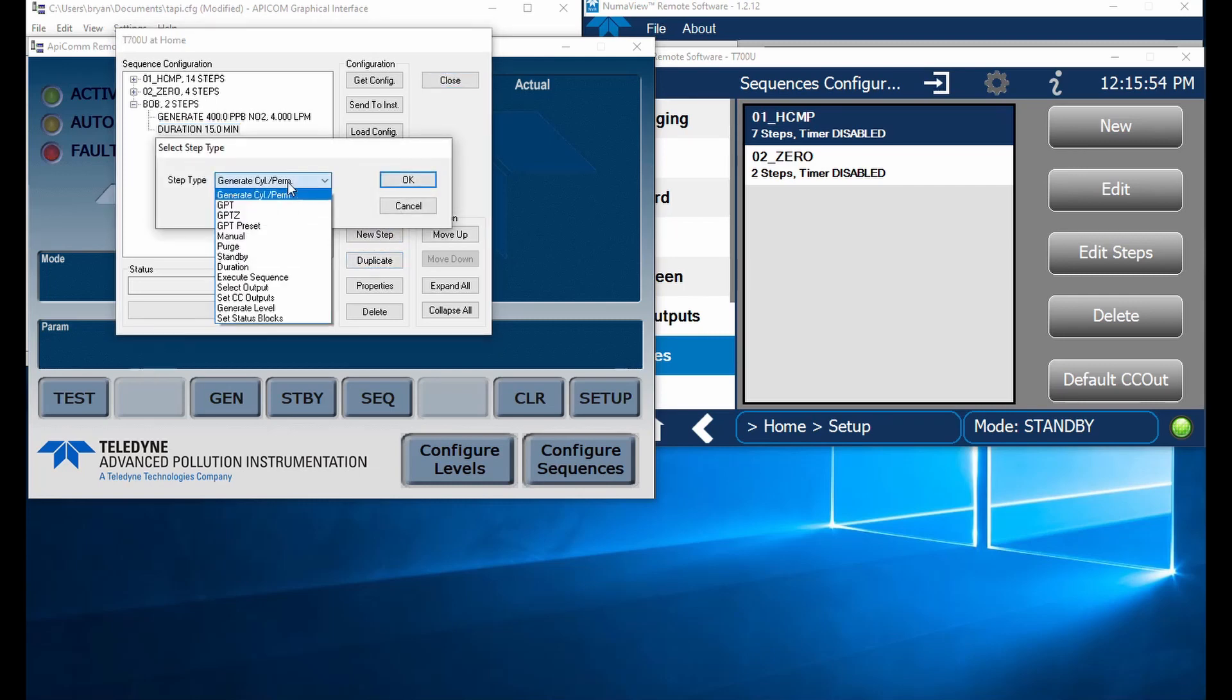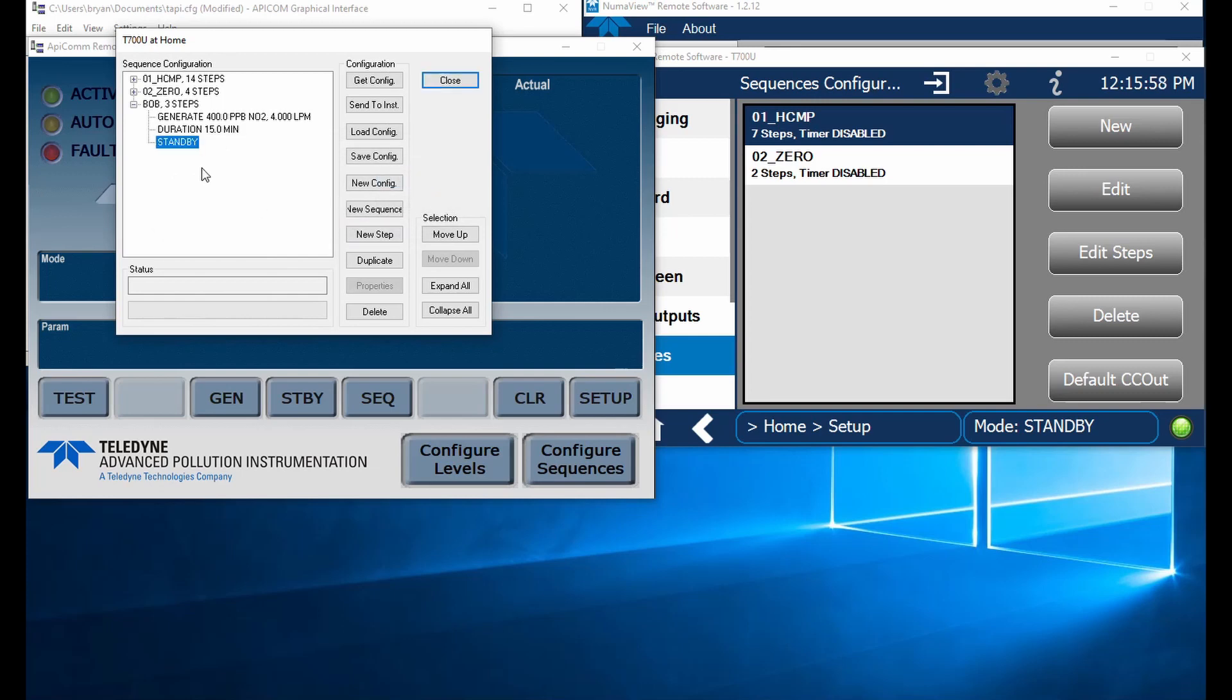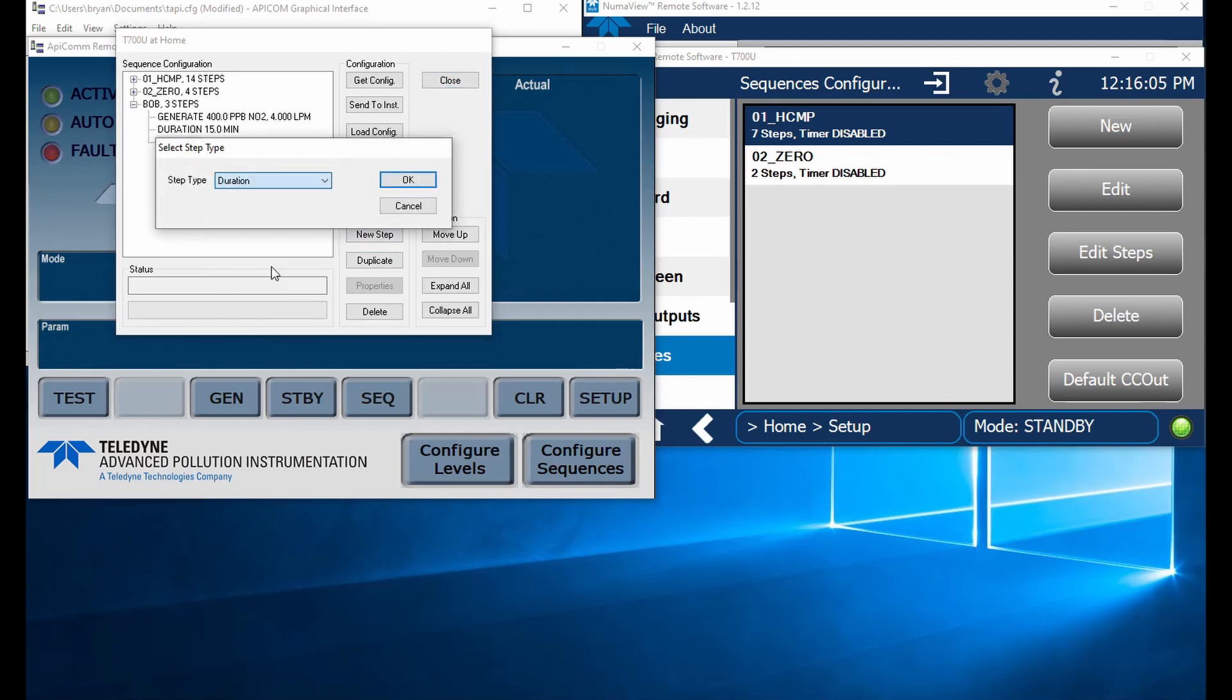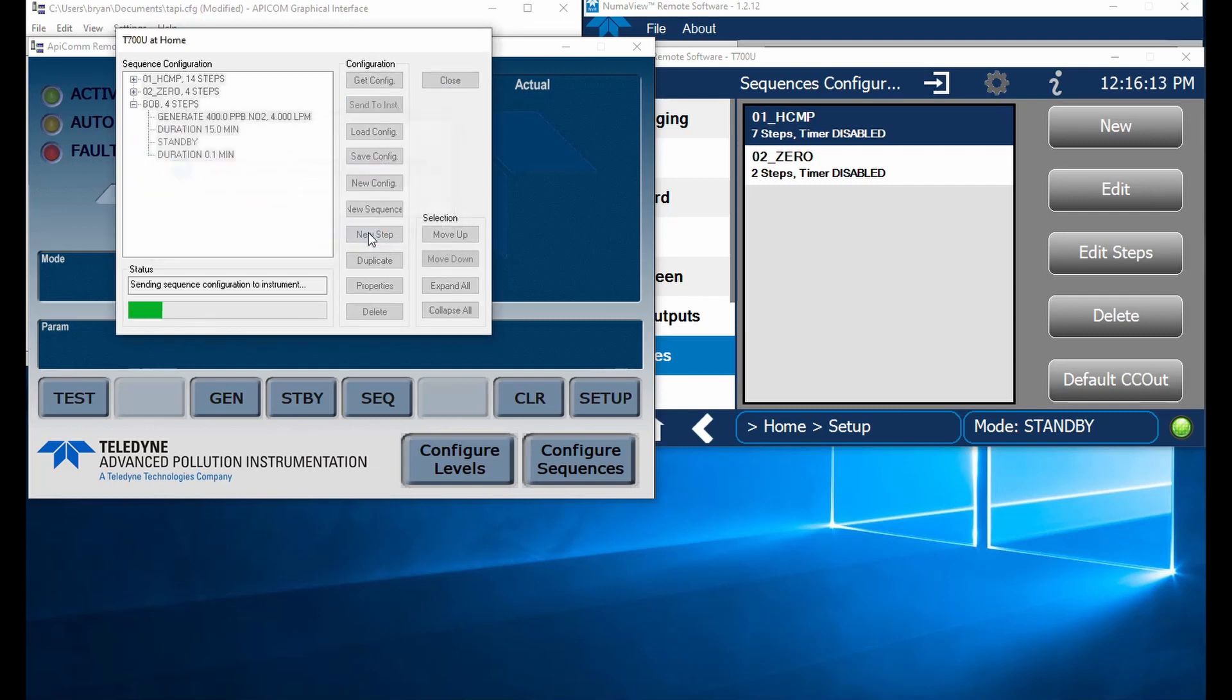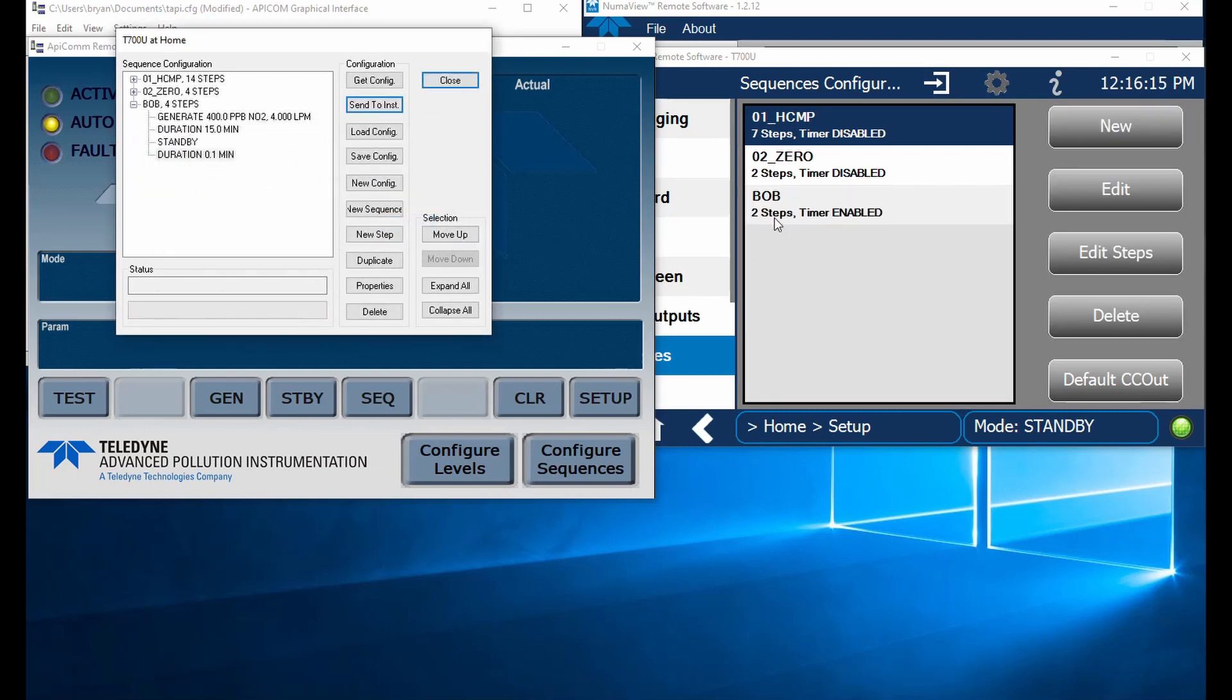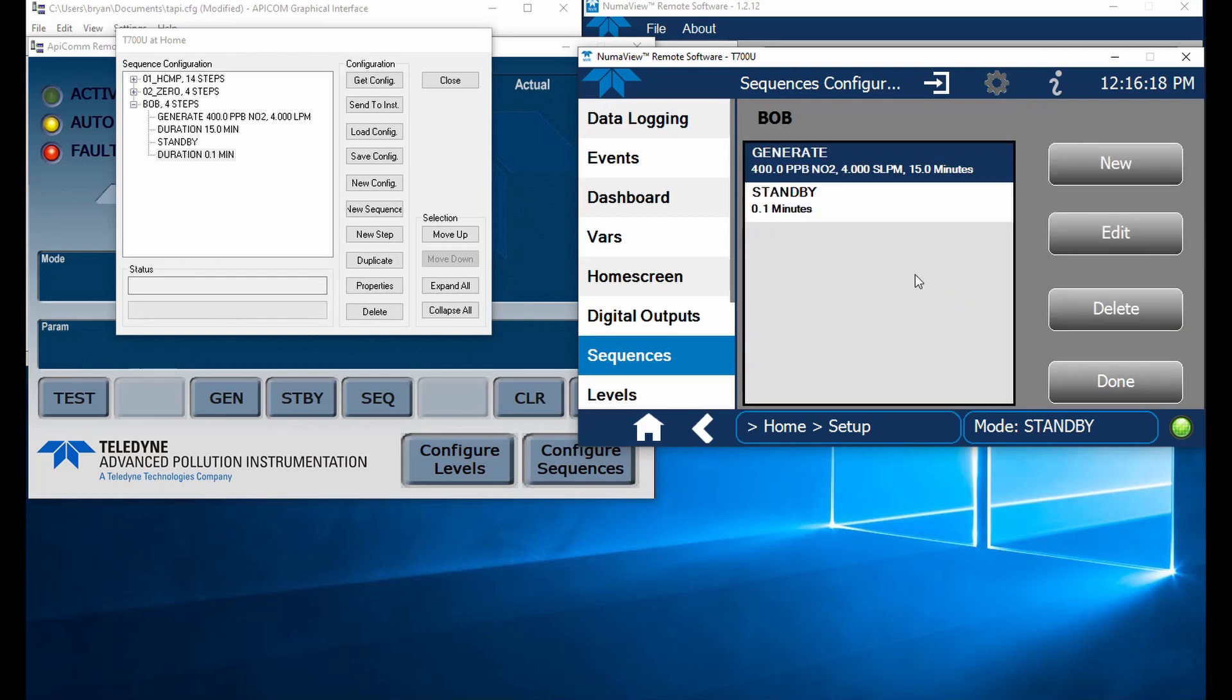We'll throw in another step. Let's say it's just a one point. We're going to put it in standby. Now standby still needs a stop sequence or a time sequence. If we don't do that, it's not going to transfer. So we're going to throw in a duration here. Let's put in 0.1. So let's send this over there. Send to instrument. All right, we've got Bob now. And it's generating 400 ppb of NO2 at 4 liters for 15 minutes. And it's got a standby bit.